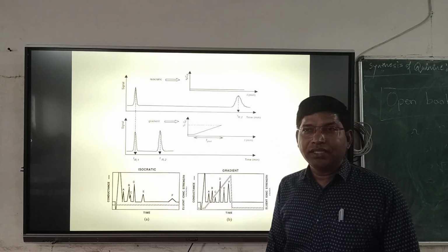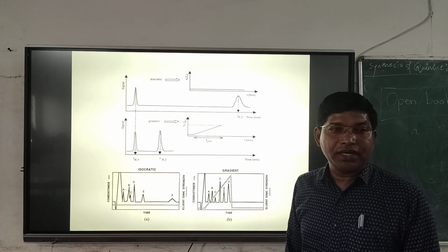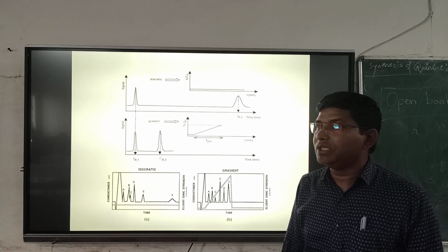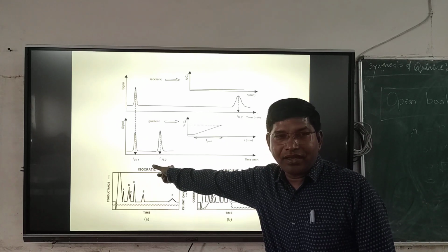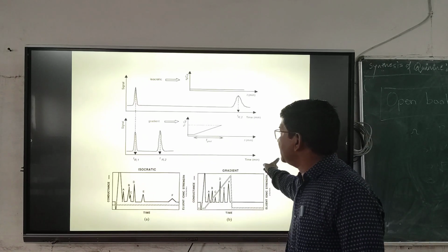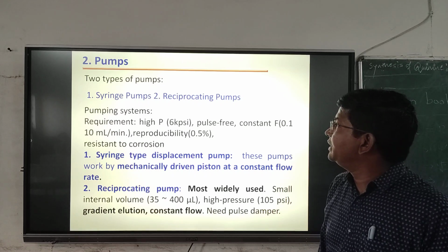So here is the summary of both elutions. What is the advantage and disadvantage of both? Gradient requires less time for analysis of your compound mixture, and also gives better resolution. So these are the advantages and disadvantages of isocratic and gradient elution.